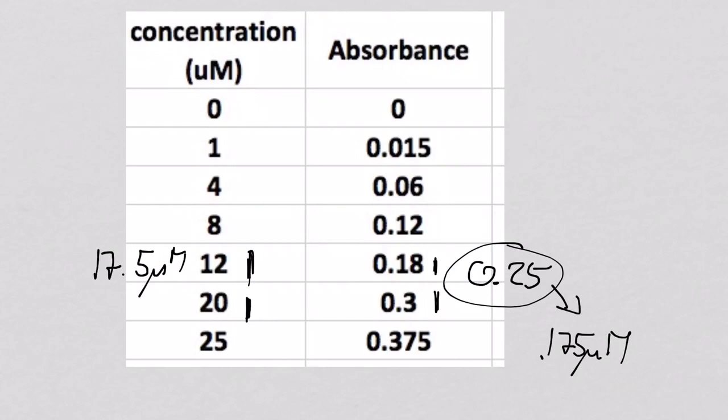So in this session, you should have seen how useful standard curves are, how important they are, how you can analyze them with Excel, how you can add a trend line very easily, and also how you then can convert the unknown substance with the help of a standard curve into a meaningful concentration. Does it make sense? You now should be able really to completely do the spectrophotometry quiz. And since you don't have anything else to do today, my advice would be give it a go. Okay? I shall see you on Monday.